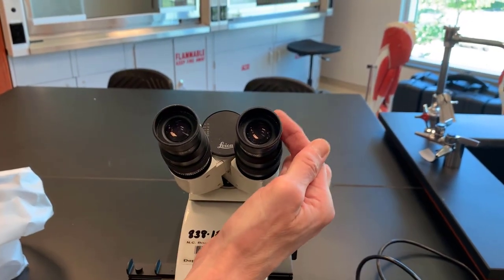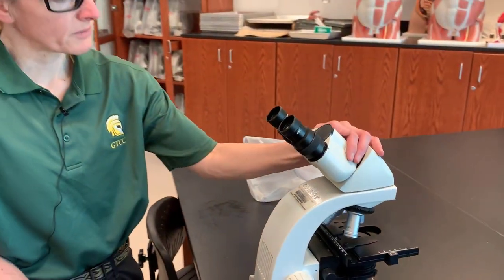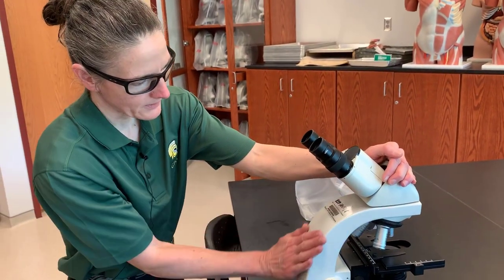The ocular lenses sit on body tubes. This whole assembly sits on a head. The head sits on the arm.